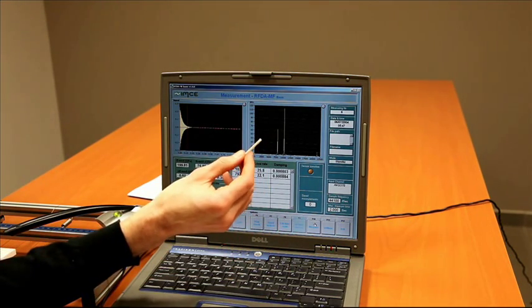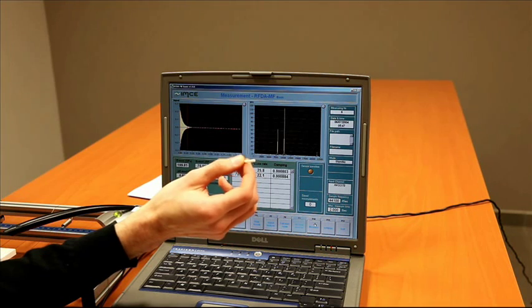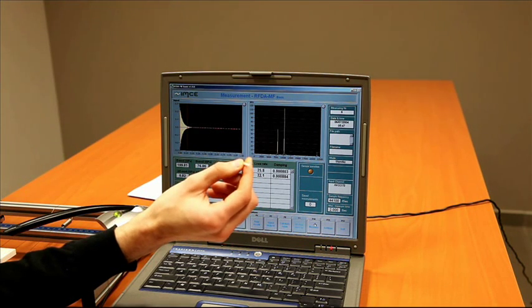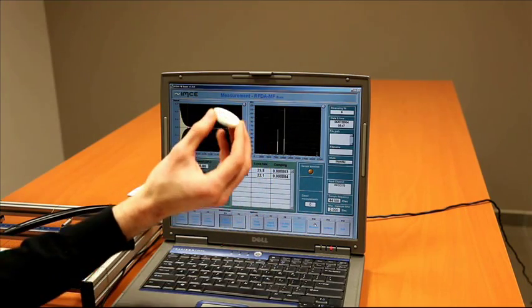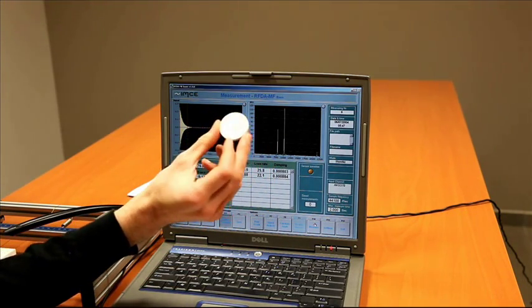This is a cylindrical rod. It's also possible to measure with this setup. And the disk shape sample.